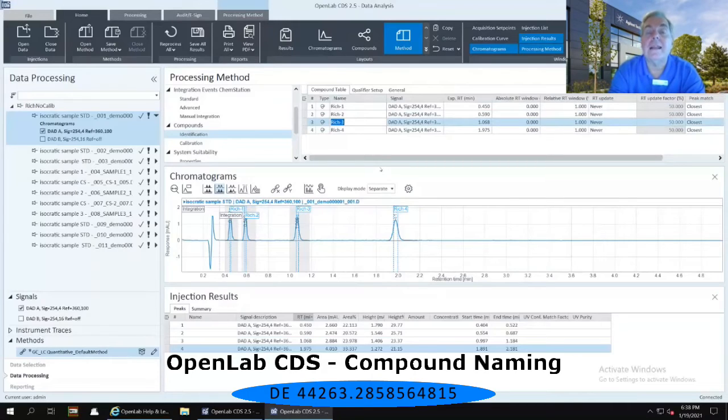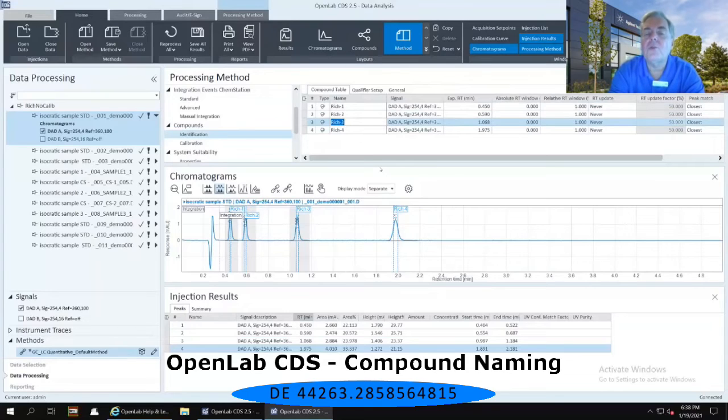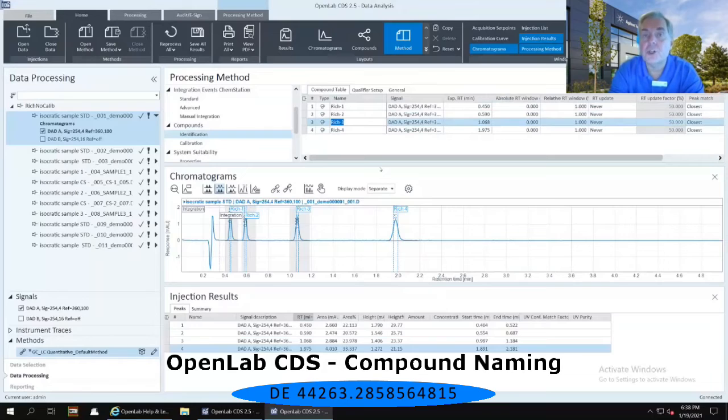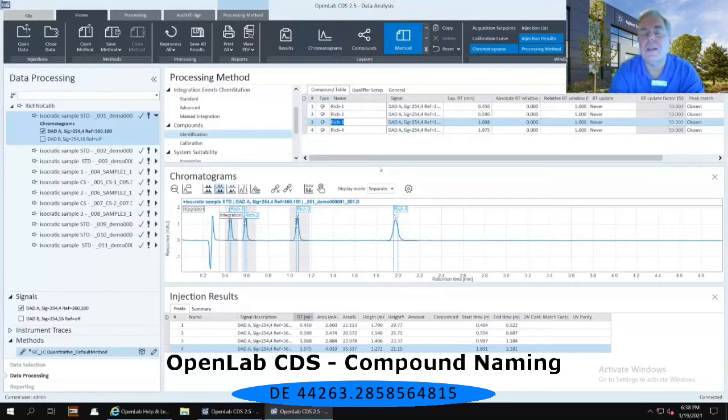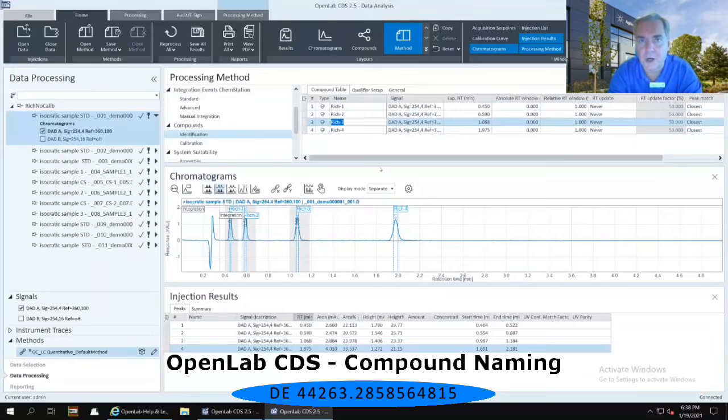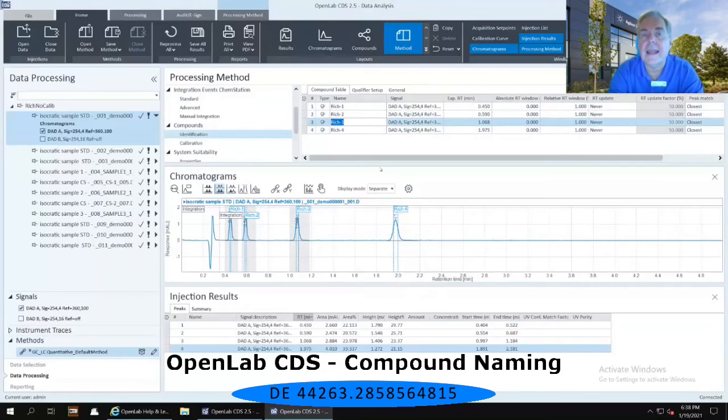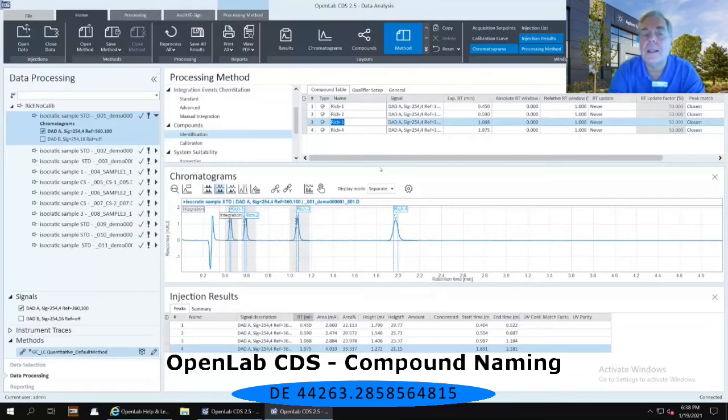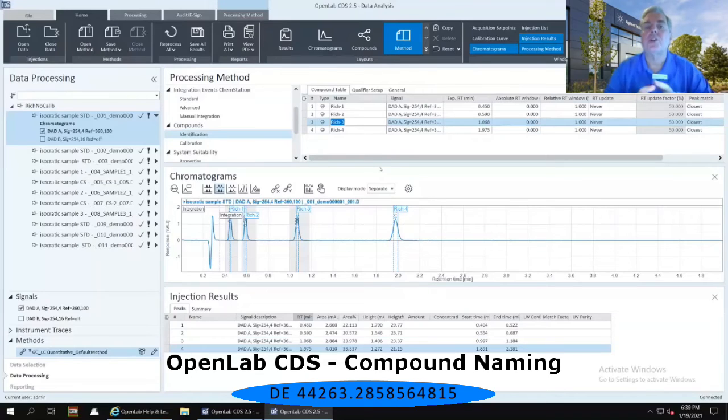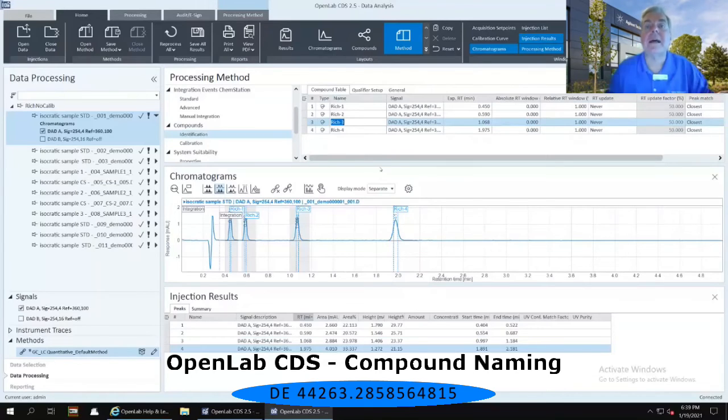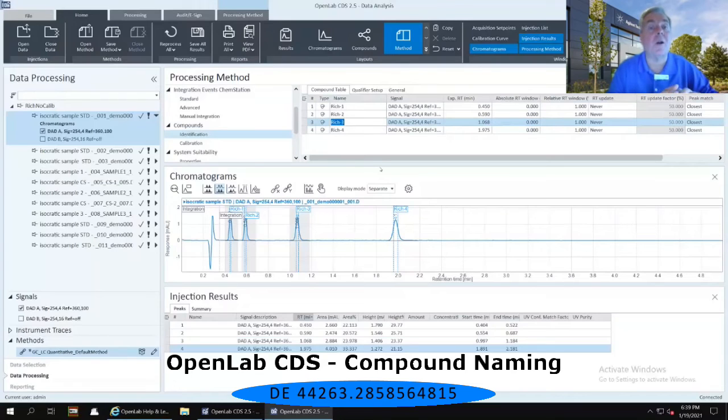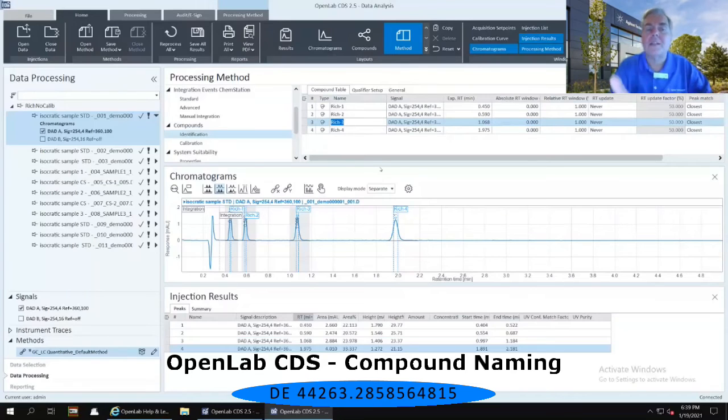Now in the ChemStation world, in order for you to name a peak in a chromatogram, it forced you to create a calibration curve. Even if you didn't put quantitation in the calibration curve, it still forced you to create one. In OpenLab CDS, those two different aspects are completely separated. I have an aspect where I want to label my peaks. That's for the identification.